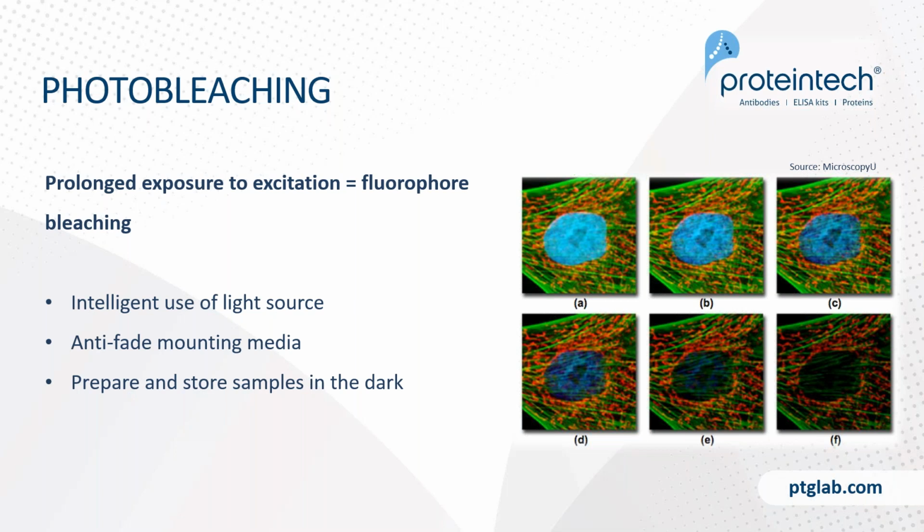One way to get around this is just to be careful when using our excitation wavelength, and also to use anti-fade mounting media. And finally, when preparing your samples, make sure you do so in the dark and store these in the dark as well.